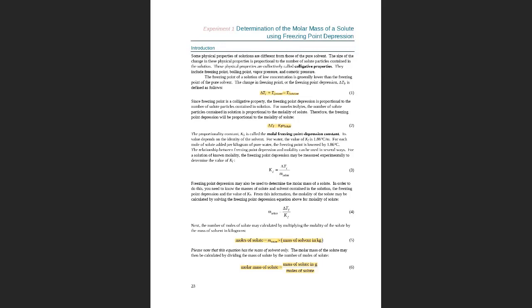Today, we will investigate the third experiment in Lab Flow for CHEM 1412 in the Southeast Campus, which is molar mass of solute using freezing point depression.